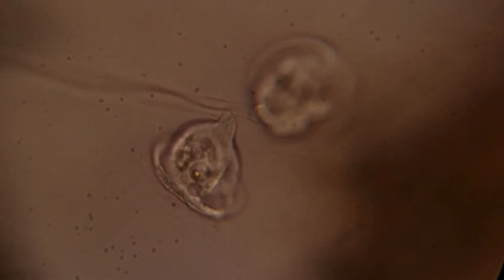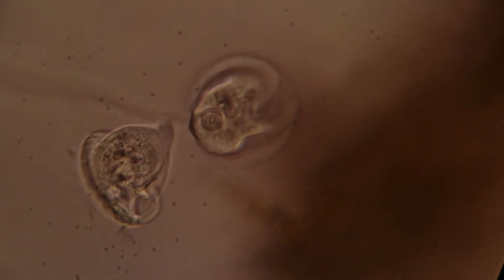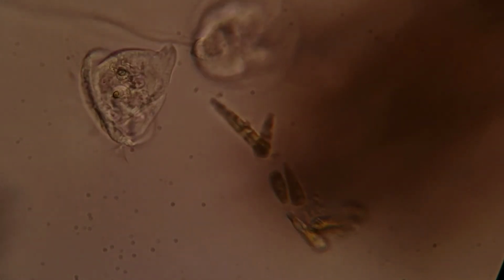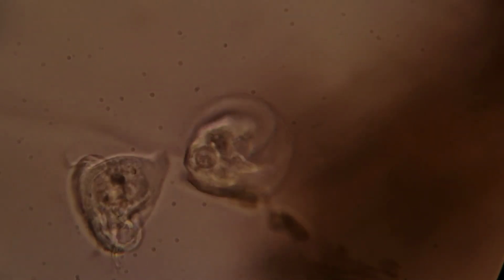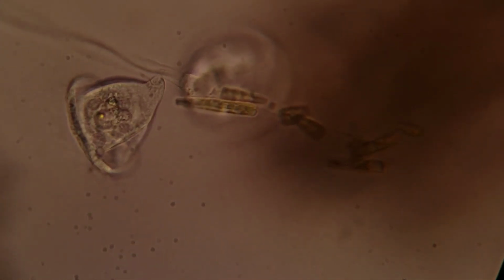And here's their little strings. Each one of them will have their own. It's gonna go all the way back and attach onto something. And they can pull themselves right back in. If they sense danger or something wants to eat them, they'll just zoop, gone. A pile of diatoms. Neat.